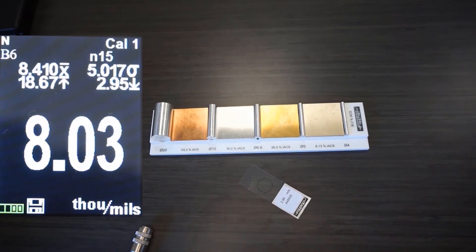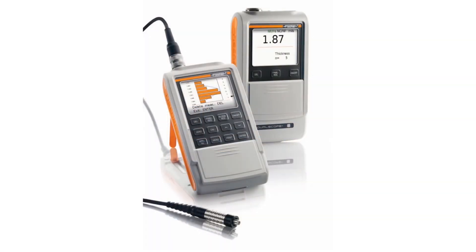So there you have it. When the dual scope FMP40 is paired with the FTD 3.3 probe, it can easily measure coatings accurately on curved surfaces thanks to the probe's patented curvature compensation technology. Probes that don't have a good way to compensate for curvature might not work when checking the coating on finished products.